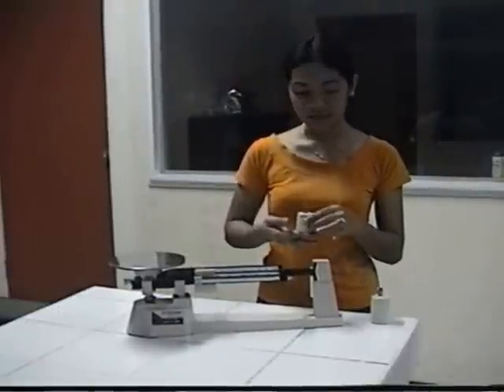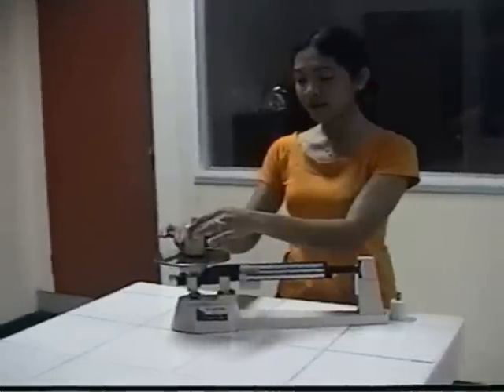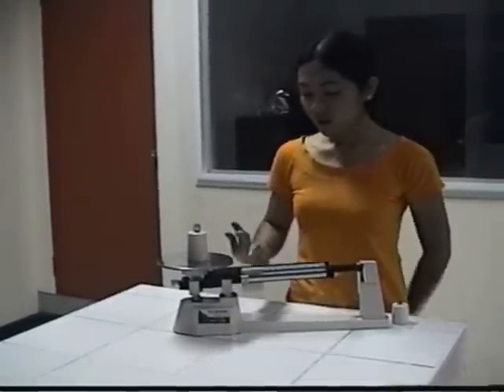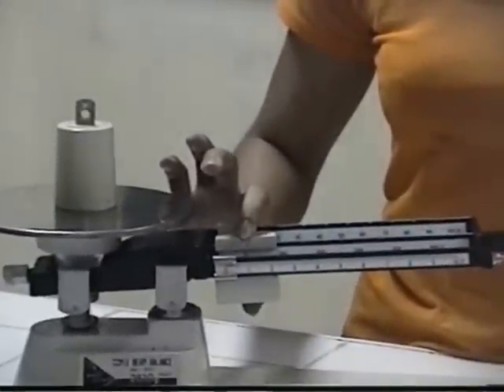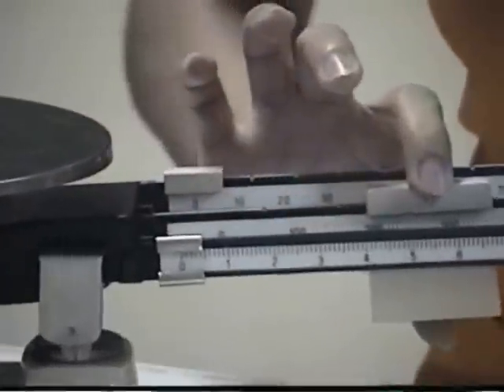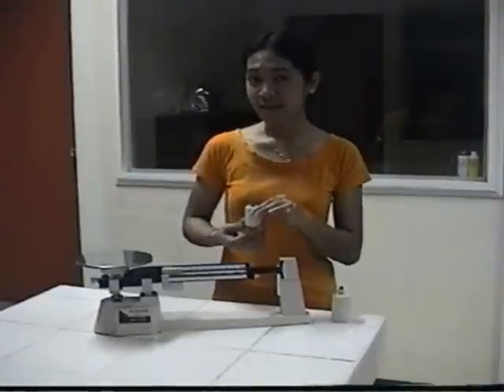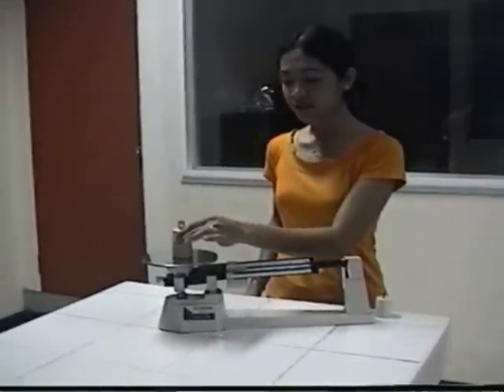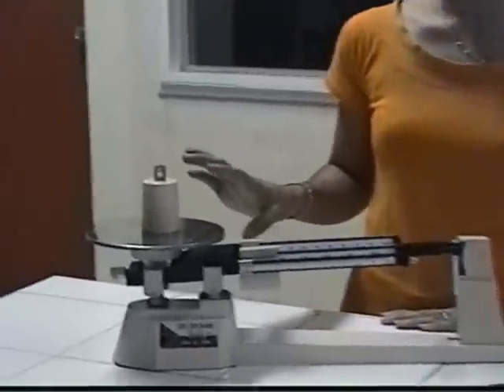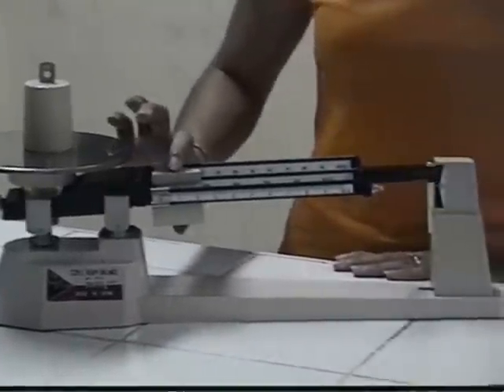After measuring the small object, let's try this big one. So again, we put it here on the metal platform. Then we use again these three riders. The first one we're going to move is the 100 rider.